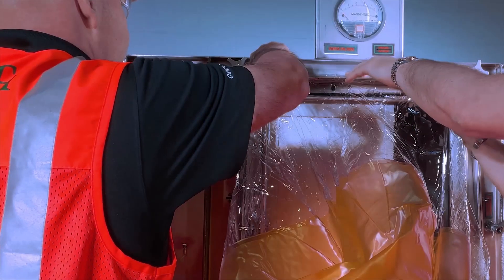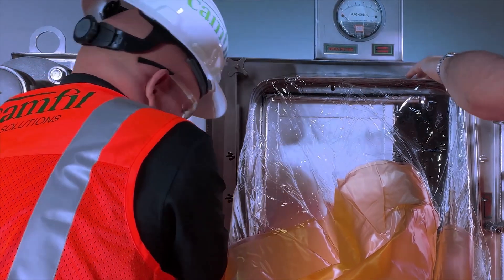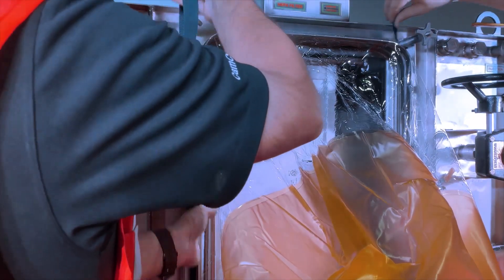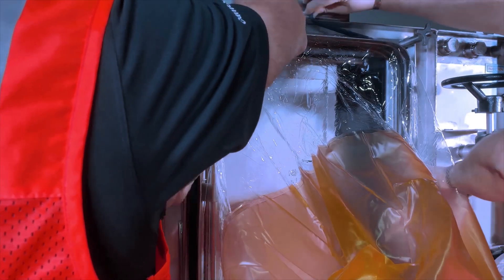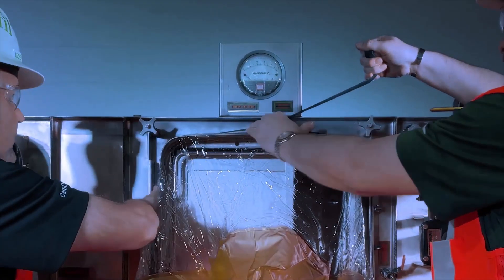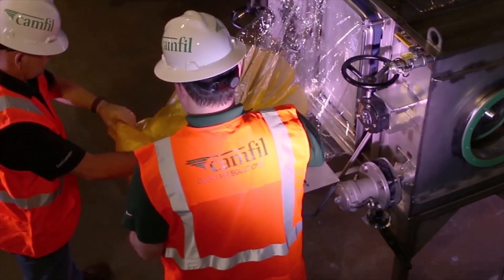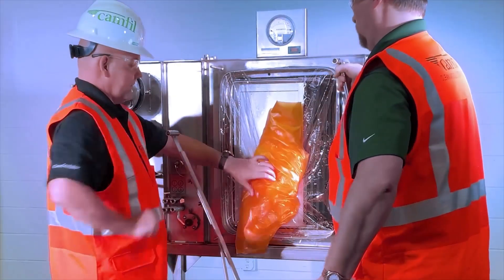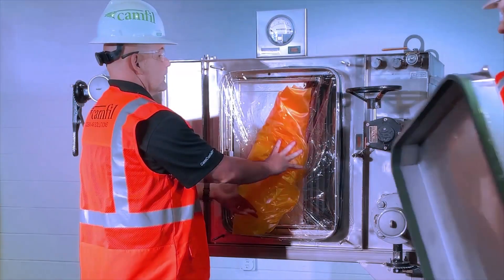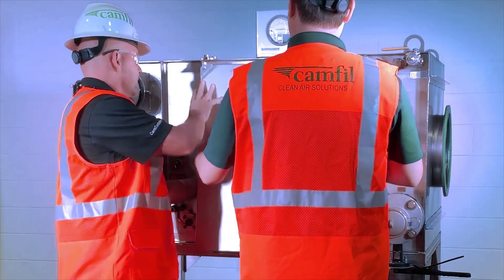Change a new change-out bag over the bagging ring, pulling the shock cord over the second rib of the bagging ring. Install the security strap over the bag between the two raised ribs of the bagging ring and secure tightly. Extend the bag out completely, then fold and roll the bag toward the housing until it is tucked neatly between the bagging ring and the filter access port. While holding the change-out bag in this position, replace the housing access door.